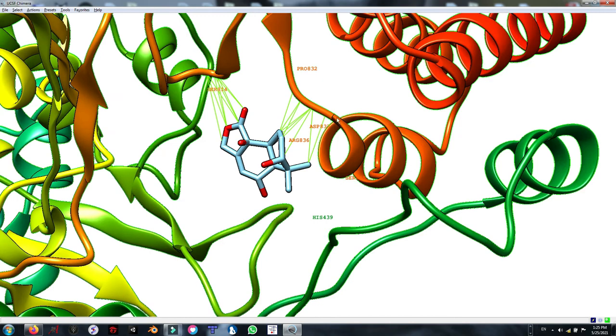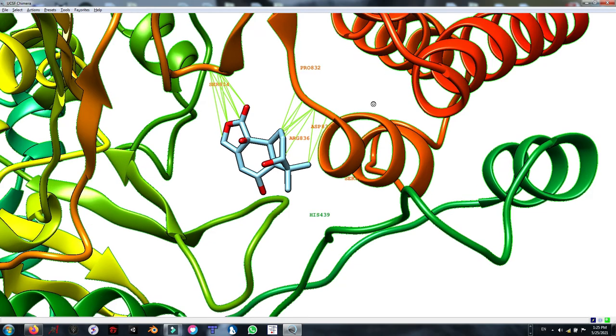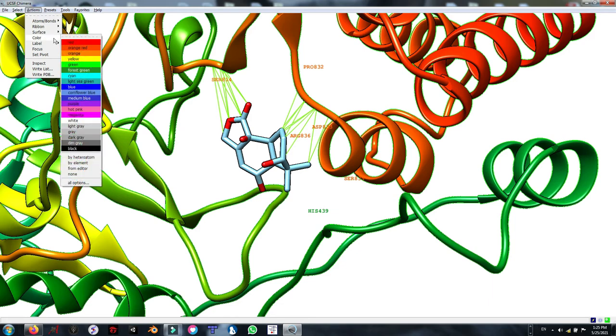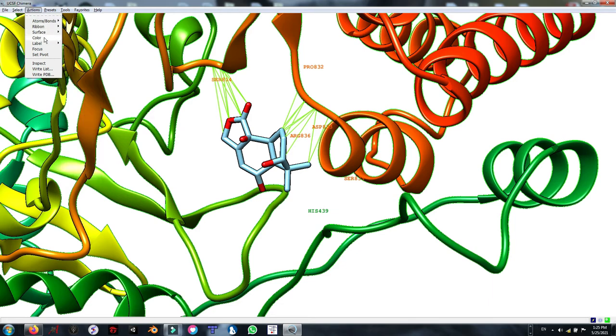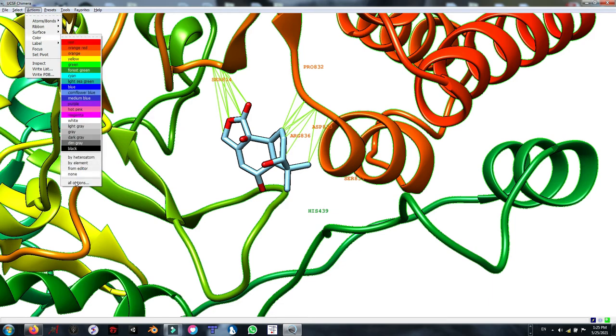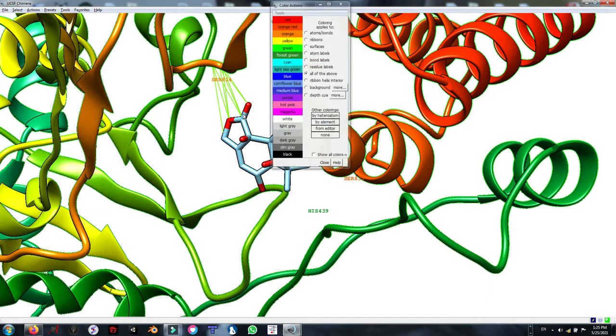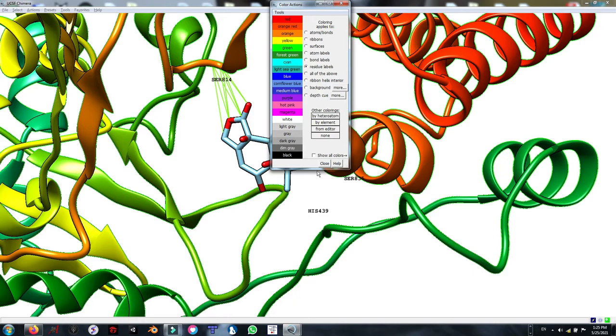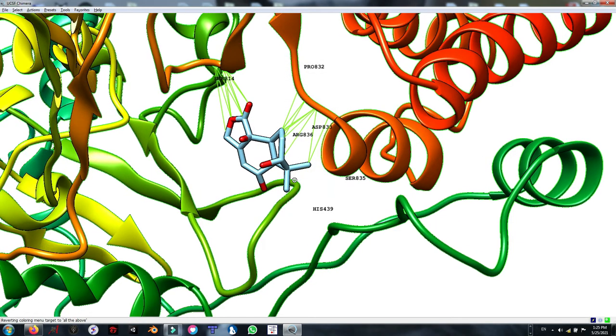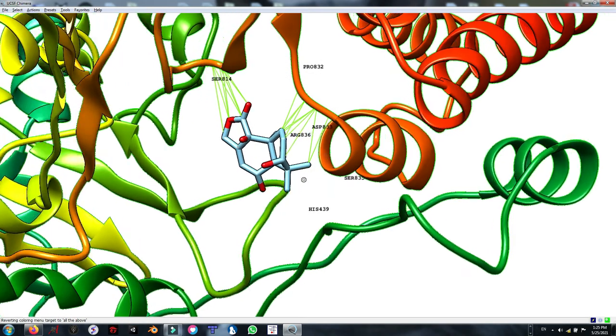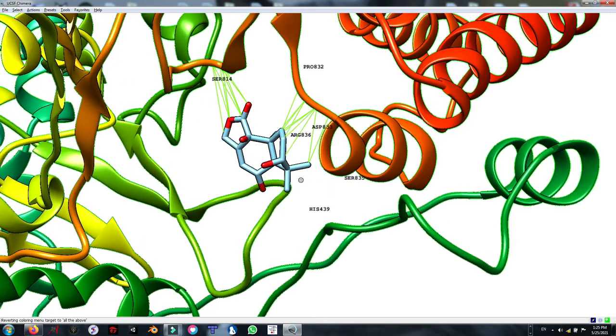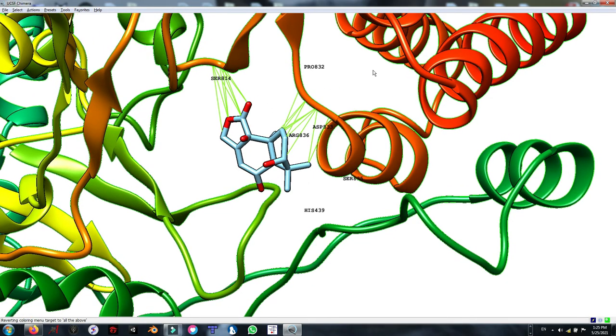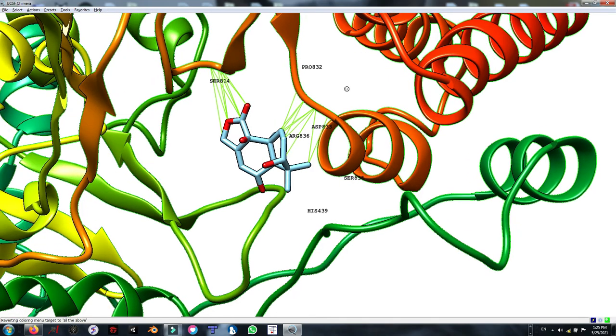But as you can see, we cannot distinguish the side chains color with the residue labels. They both are in orange or something very similar. Let's change the color from the action color and all options. From all options, I check residue labels and turn it to black. As you can see, the labels turned into black and very distinguished from our ligands and amino acid residues. That's very good.